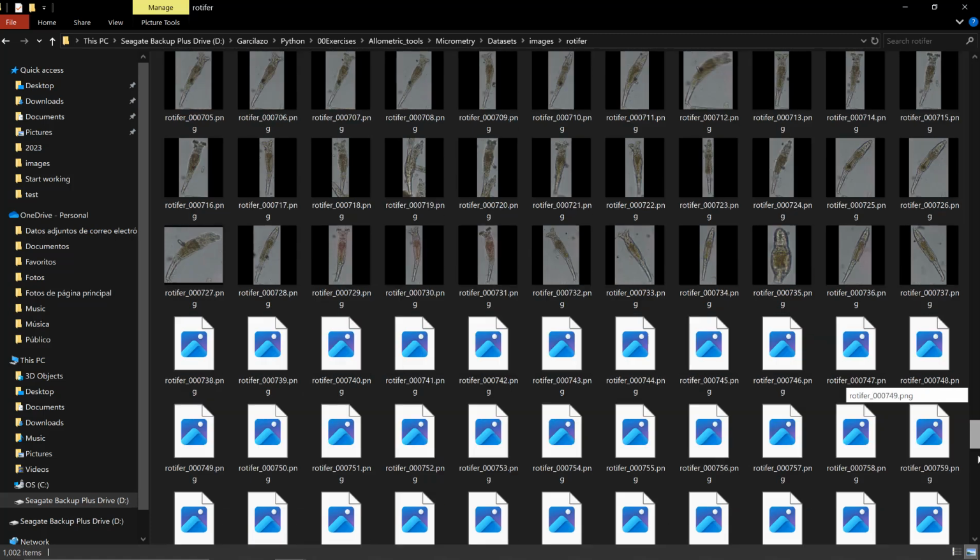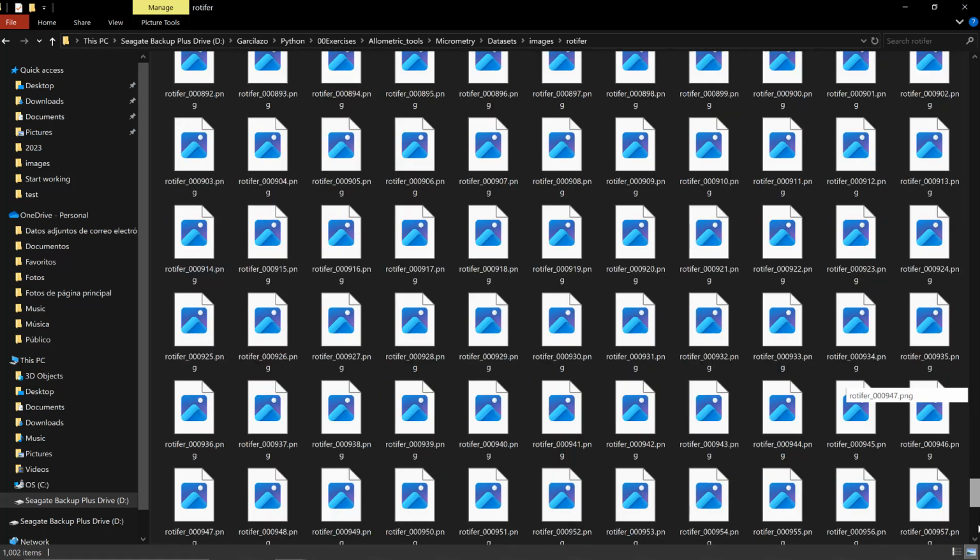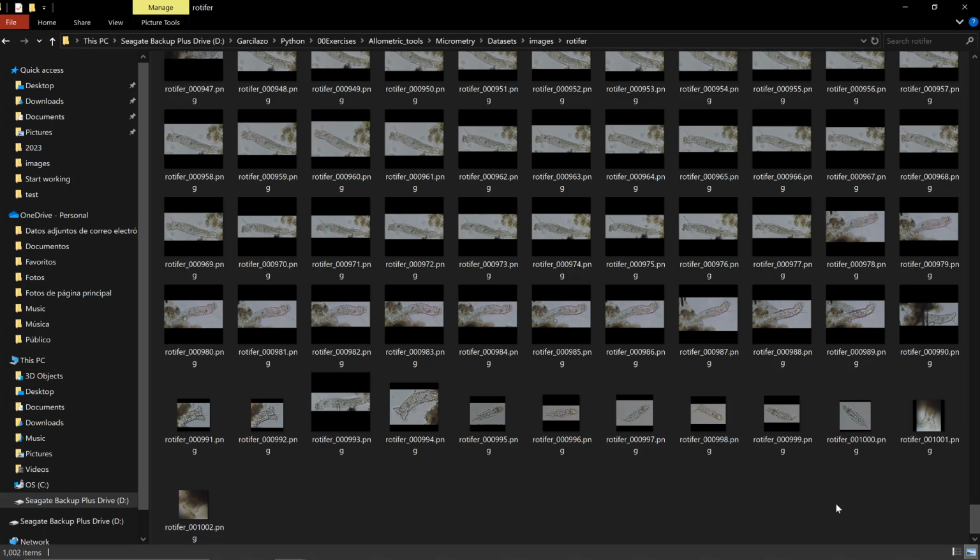Datasets allows us to work fast with live specimens in order to create big amounts of data in a relatively short period of time. Notice also the presence of padding. The padding occurs when you delimit an area that is not perfectly square. The dimensions of the squares are different as well, and this is something that you should take in consideration when you import the models into your program. You should normalize them to a particular dimension. I don't do it directly in the program because different applications may have different requirements.